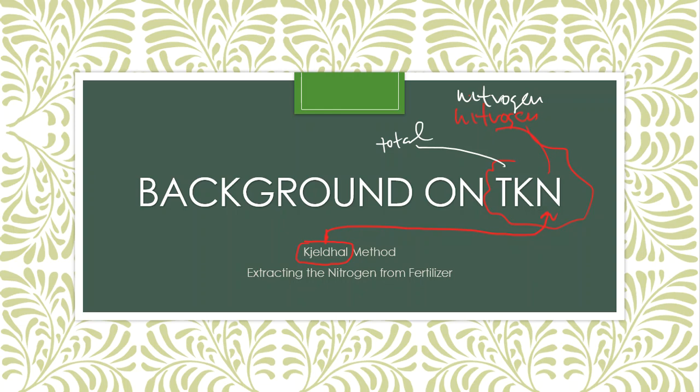So that's what we're doing in this lab activity. We are introducing you to the TKN that you'll see again using different types of samples the next time you see it. And we're going to give you the basics of what you need to know about how to do this process the right way, or this lab method the right way. And we're going to change it up a little bit.